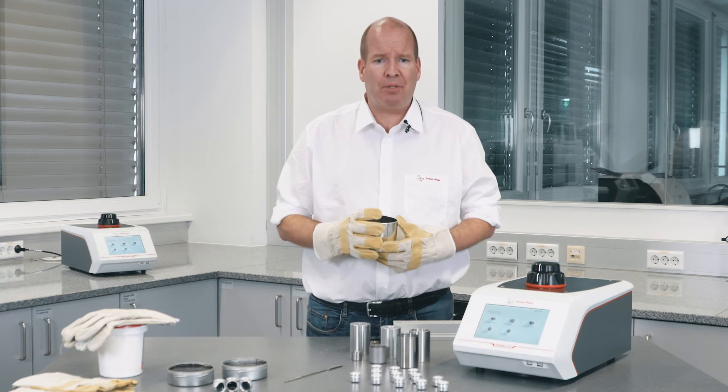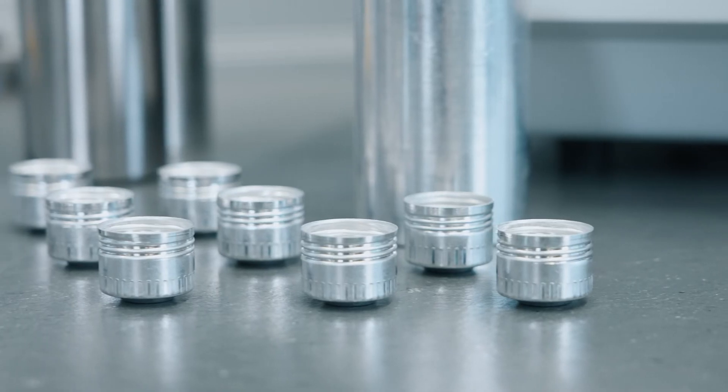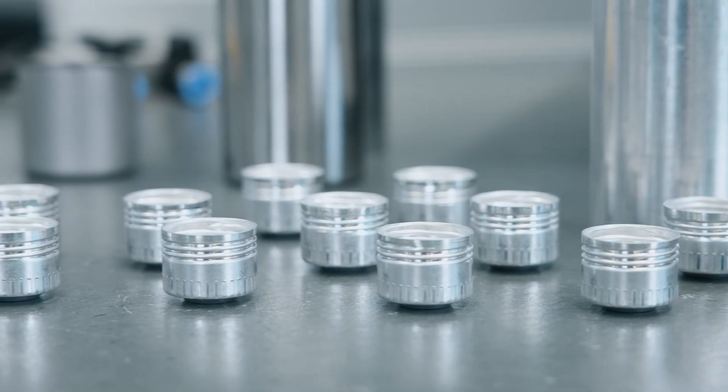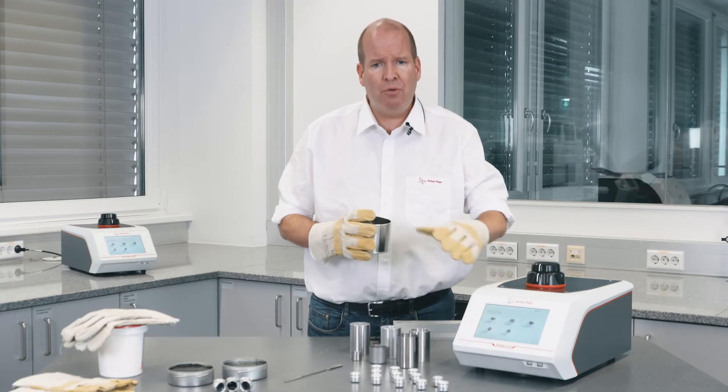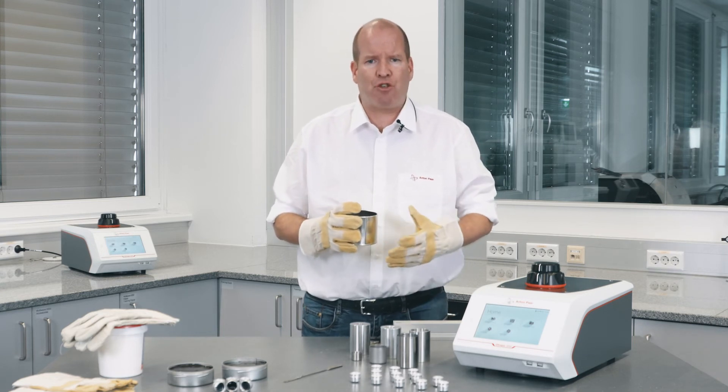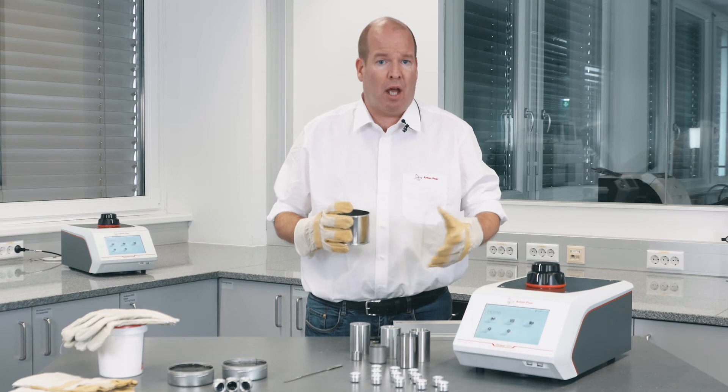Disposable sample cups increase sample throughput and make for easier, cleaner analysis. To measure density, the Ultrapick uses the gas displacement method, determining the amount of gas required to fill a chamber with and without samples.